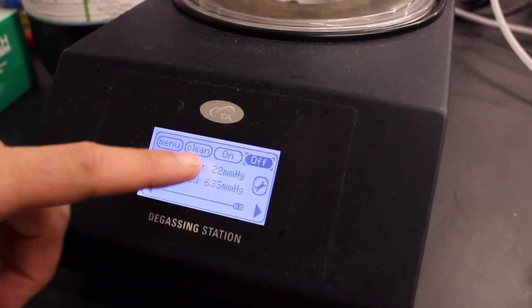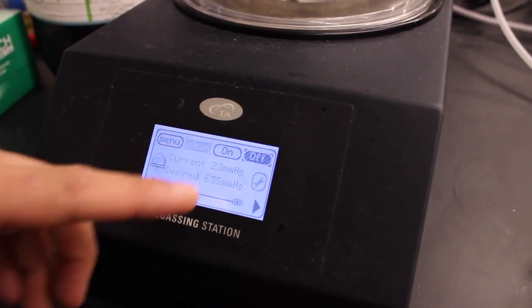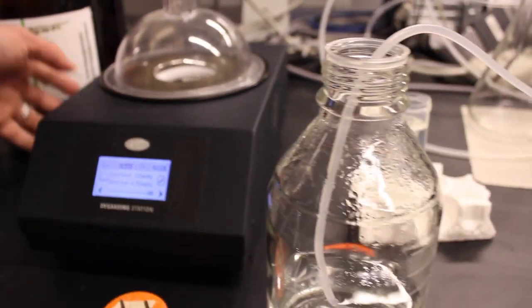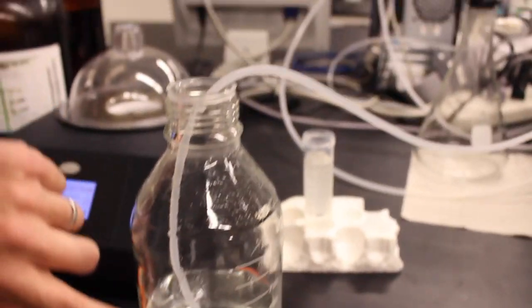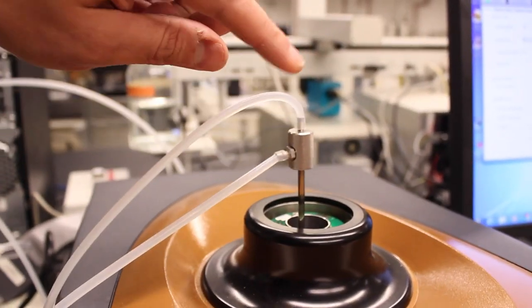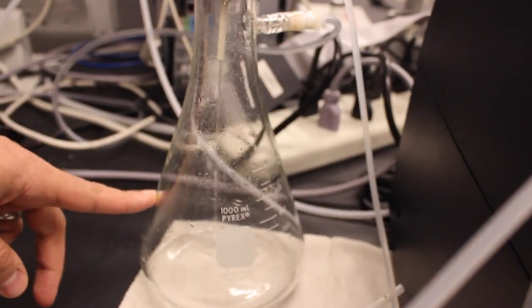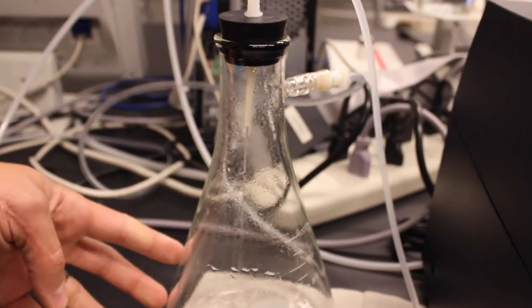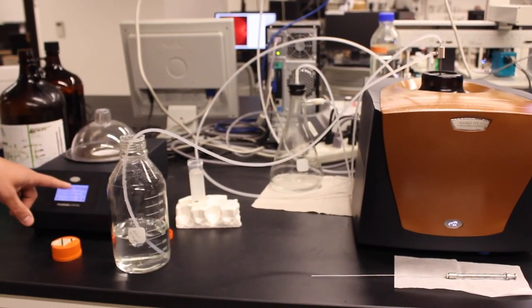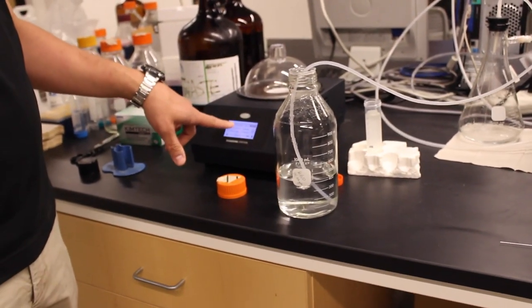Use the degassing station. Press the button that says clean. It will turn on the vacuum pump. It will start to suck up the solution through the cleaning wand and then the liquid will come out in this container here. You can turn off the vacuum by pressing the clean button again.